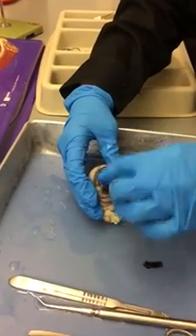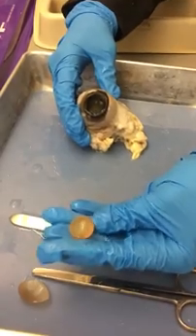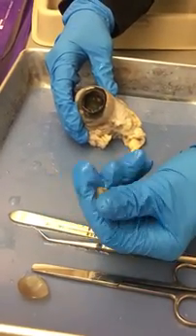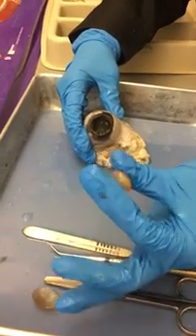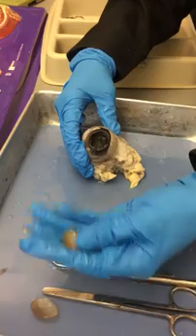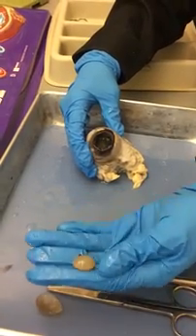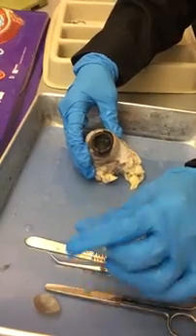So here's the lens right here. I could pull it out. It looks like a marble. It feels very tough, and it is, but it's also flexible. Remember, this is going to be the structure that bulges or becomes more flat to focus light on the correct spot in your eye, so you could have vision.